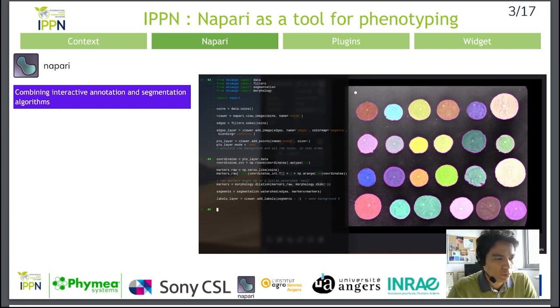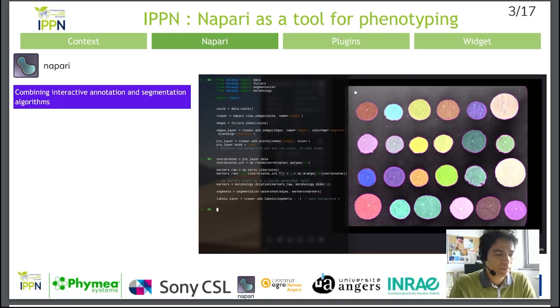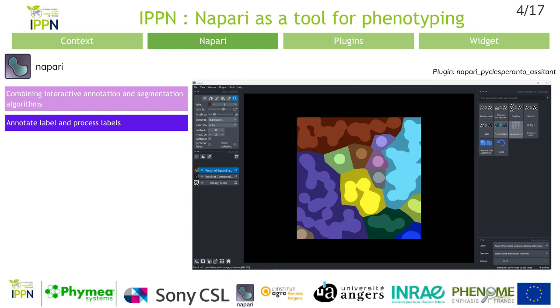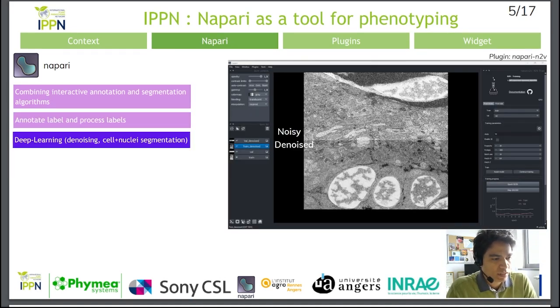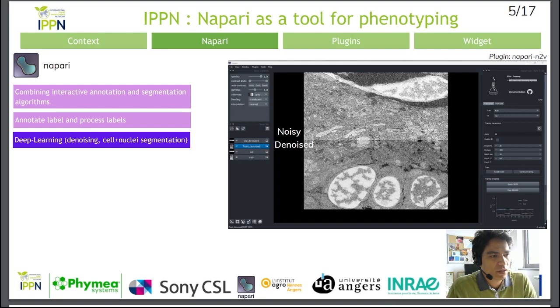I'm now going to show you a few things you can do with Napari. First of all, you can write code and interact with your data directly in Napari. For example, you can write a segmentation algorithm and see the result directly in the Napari window. There is a plugin that lets you annotate and process labels using classic image processing techniques. Some plugins allow you to manipulate a deep learning model — for example, you can train or retrain a denoising model with the N2V plugin. Once you have developed your model, you can run inference on an image and view the result directly from the Napari window.